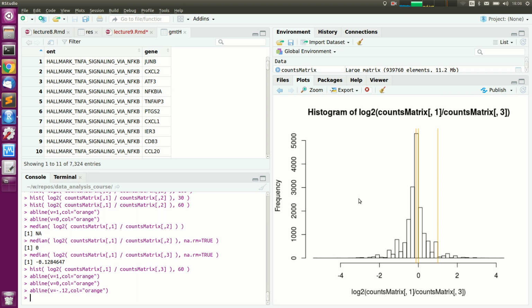First, scaling. We assume that in RNA-seq, this problem of normalization solely stems from the fact that sequencing depth is arbitrary. How many reads you get out of your RNA-seq data in the end only depends on how you load the flow cell. If you take a little bit too little material, you get fewer reads. If you take too much material, you also get fewer reads because your clusters overlap. And this can, of course, differ from lane to lane. So it has no biological meaning whatsoever.